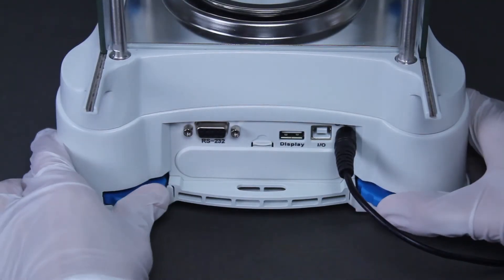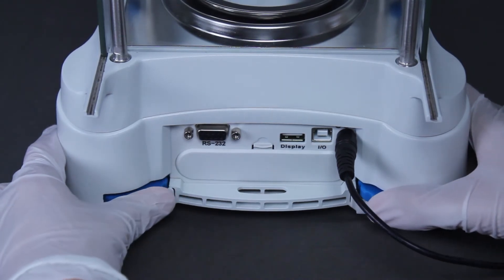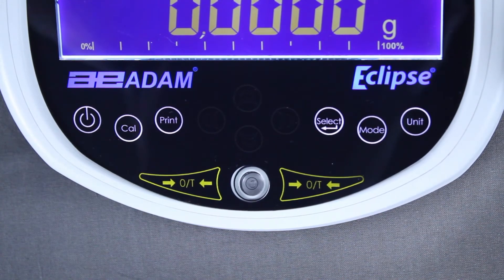Fine-tuning the balance during setup is accomplished with adjustable rear feet, ensuring optimum weighing results. Users can monitor the leveling indicator located prominently on the front of the Eclipse.